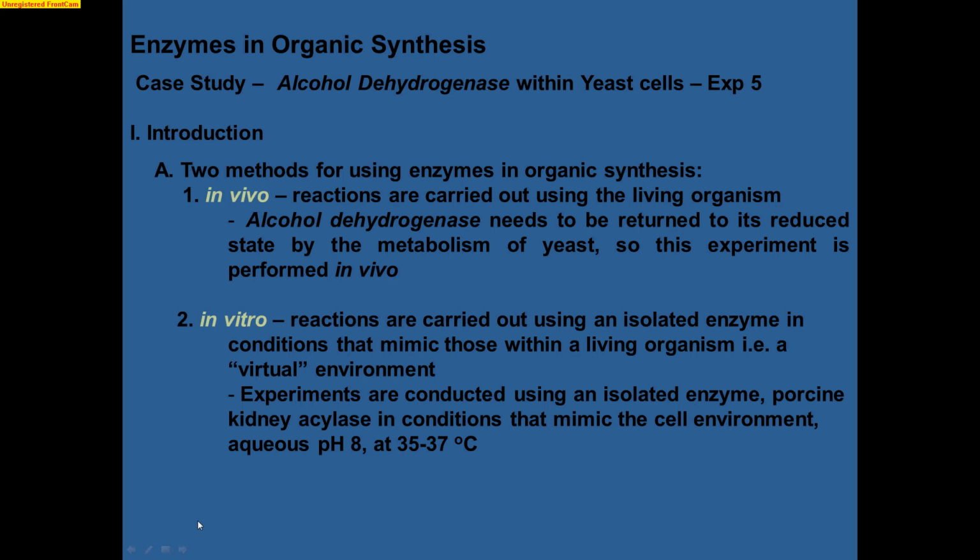Alright, so the exact reaction that we are going to be doing here is we are going to be utilizing the alcohol dehydrogenase that exists within yeast cells. Alcohol dehydrogenase is the main enzyme which is responsible for converting acetaldehyde to ethanol. There's two methods that you could potentially use. You could either do in vivo, which is the one that we're going to do, or in vitro. In vitro, what you would be doing is using purified enzymes, and you would try to mimic the conditions that exist inside of a yeast cell.